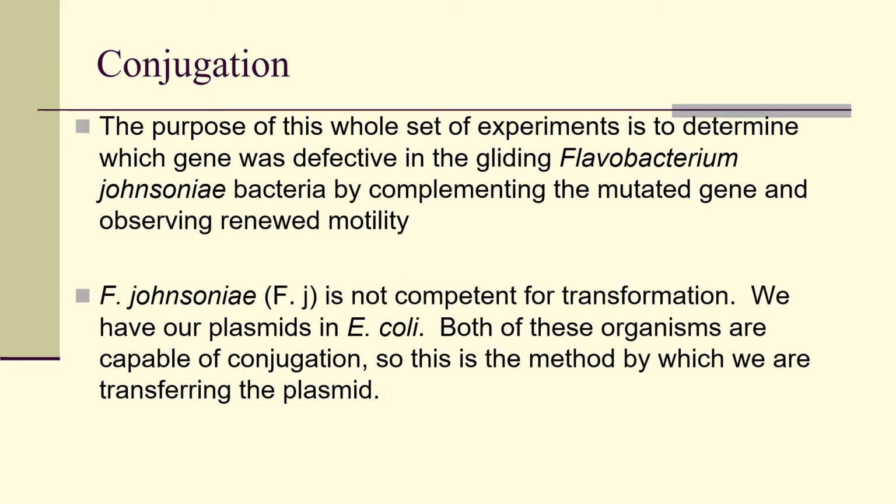The transformation conjugation experiment started on the 5th week. This is a long experiment with several sessions, and you will need to write a lab report including all these steps for this experiment. So you need to keep track of what we do each session and start working on the lab report so that you won't be lost and confused.